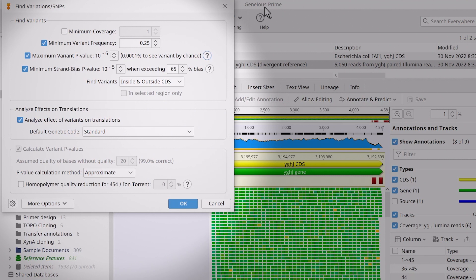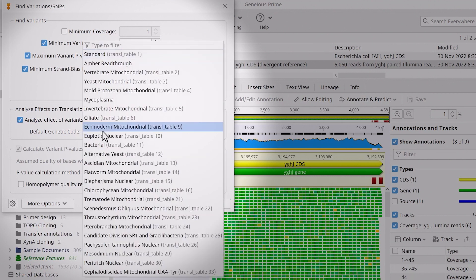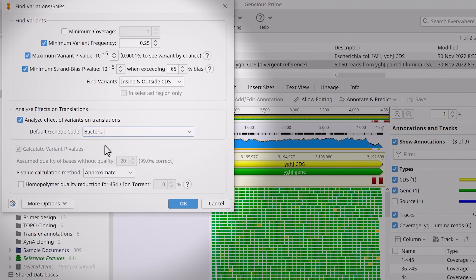Ensure you select Analyse effect of variants on translations and change the default genetic code to that representing your sample. In this case, this is bacterial.